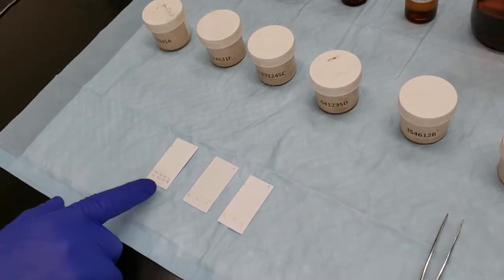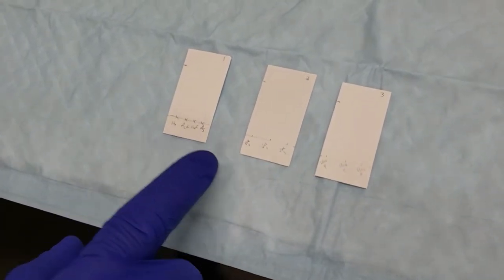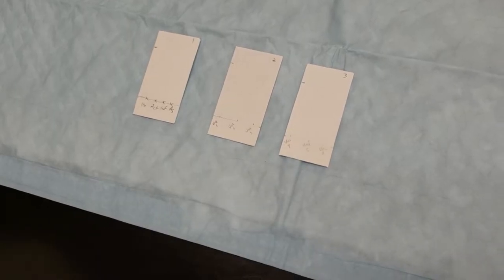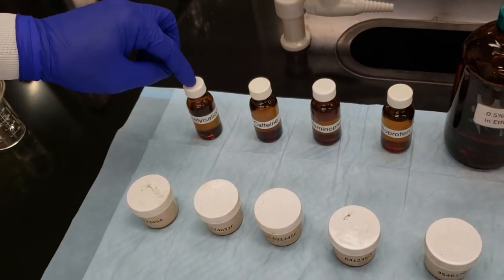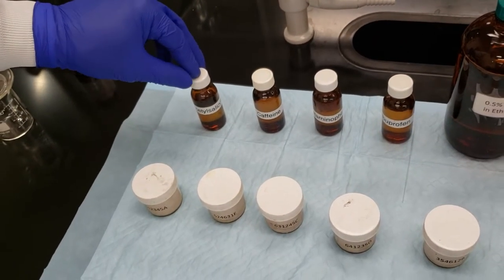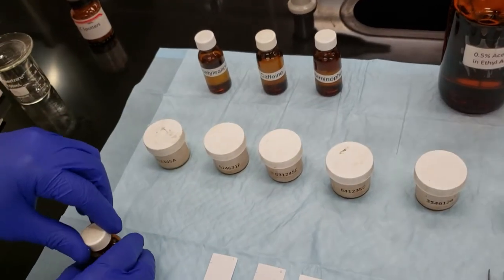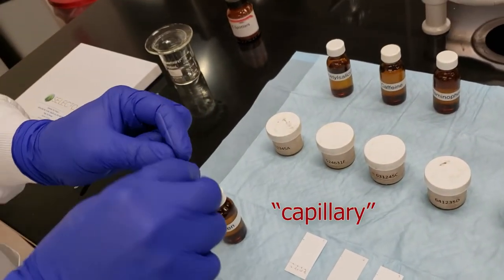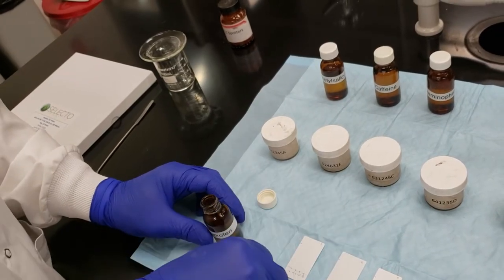We've constructed all three of our plates. We've got our known components on plate one. We've got unknown 1, 2, and 3 on plate two, and then 4, 5, and 6 on plate number three. We're going to start off by spotting plate number one with our known analgesic components. So we're going to do ibuprofen in our first lane. Let's take our ibuprofen, which is already in solution. I'm going to take a new unused spotter pipette. Very important that we do that. We don't want to mix any of these.